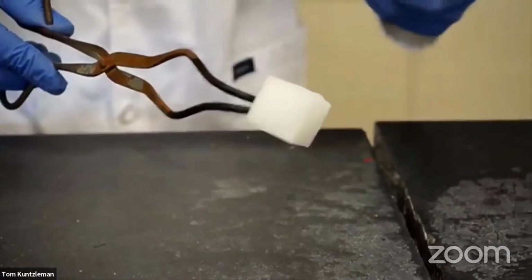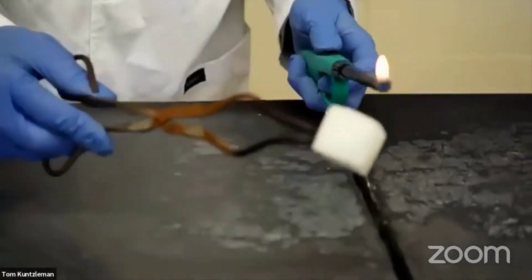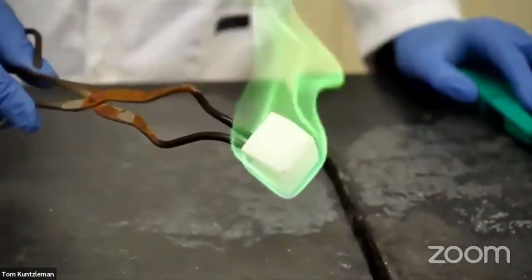Well, I'll bring a second lighter. Good thing I did. All right, let's try it here. Oh, look at that. That is gorgeous.